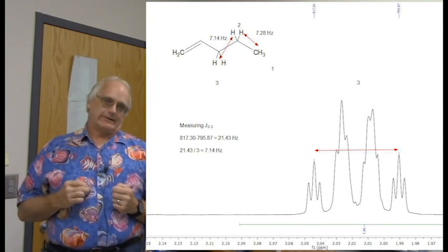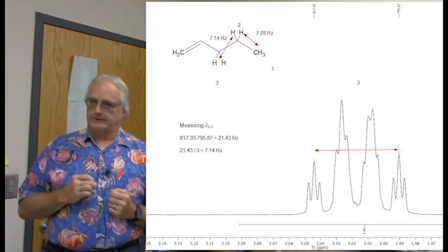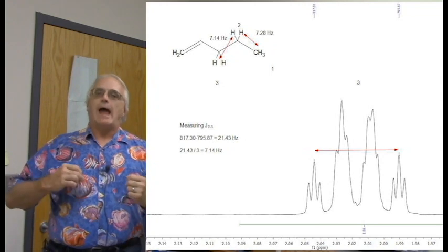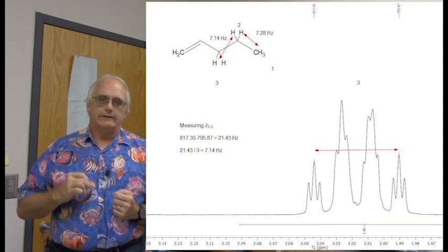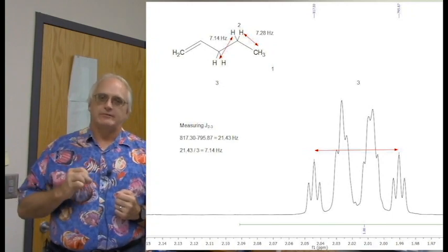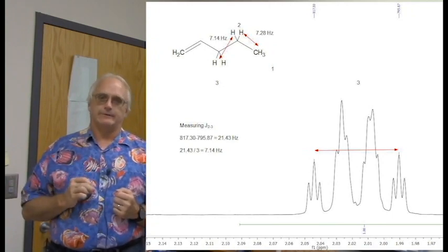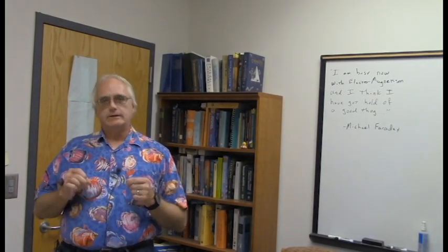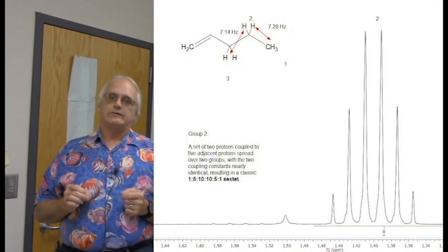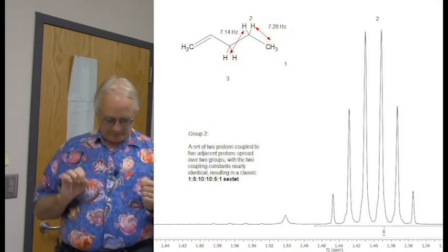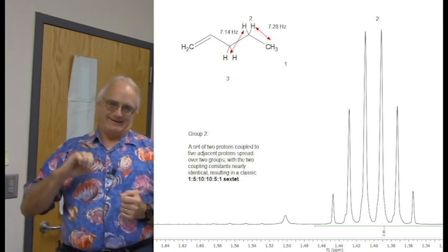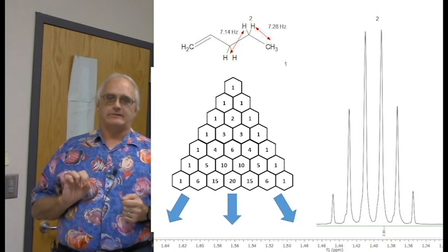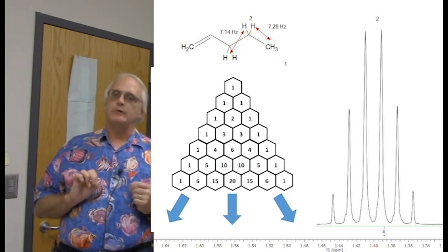That is how you get a sextet. You have to have a proton or a group of protons under the influence of at least two different groups, adding up to five protons total, and the coupling constants between those groups have to be identical to each other, or nearly identical to each other, as they are in this case. So looking in on the sextet pattern, here it is. It is a classic textbook 1-5-10-10-5-1, the sixth row of Pascal's triangle sextet. It is just a stunningly beautiful pattern to look at.